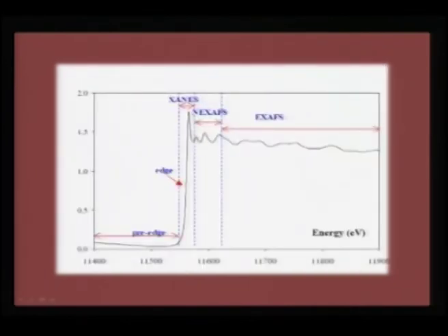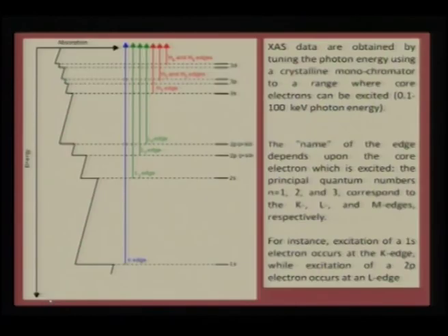As I told in the previous one, we are talking about different forms of spectroscopy here, and this is the XAS spectroscopy that we are precisely talking about, and the relative scale of energy that involves each of the spectroscopies is also given. Therefore, we can single out and say that I am exactly talking about XAFS, or XANES, or XAS based on the energy range that we are using for these spectroscopies.